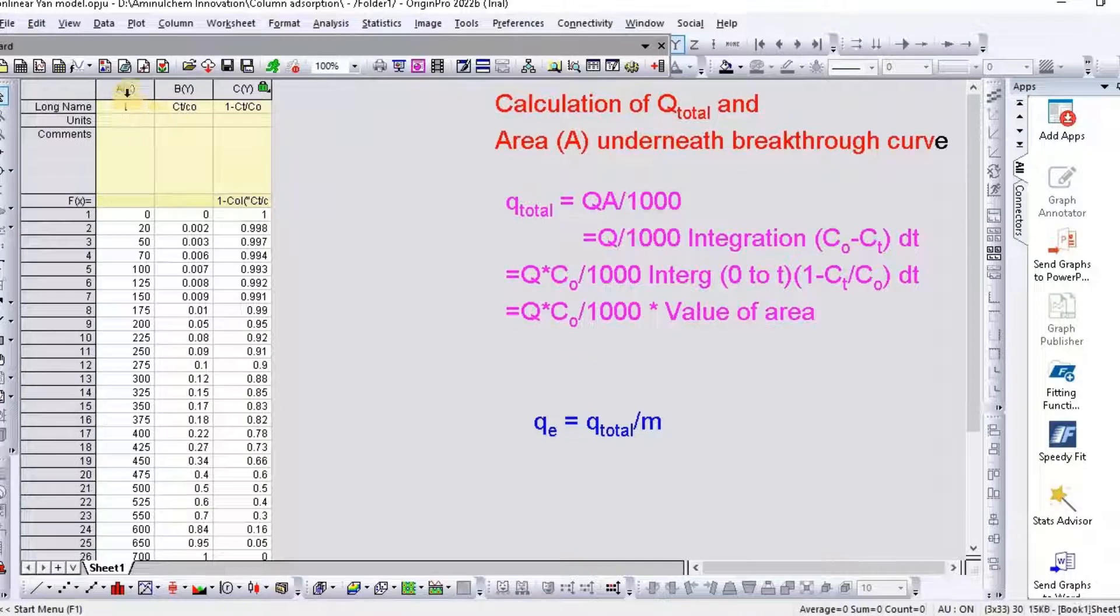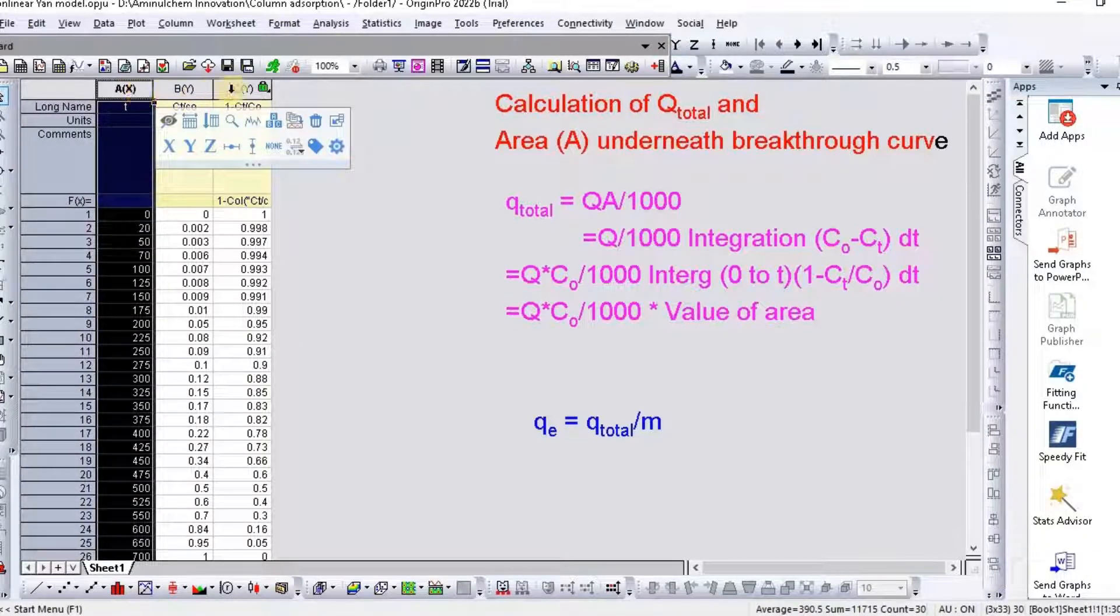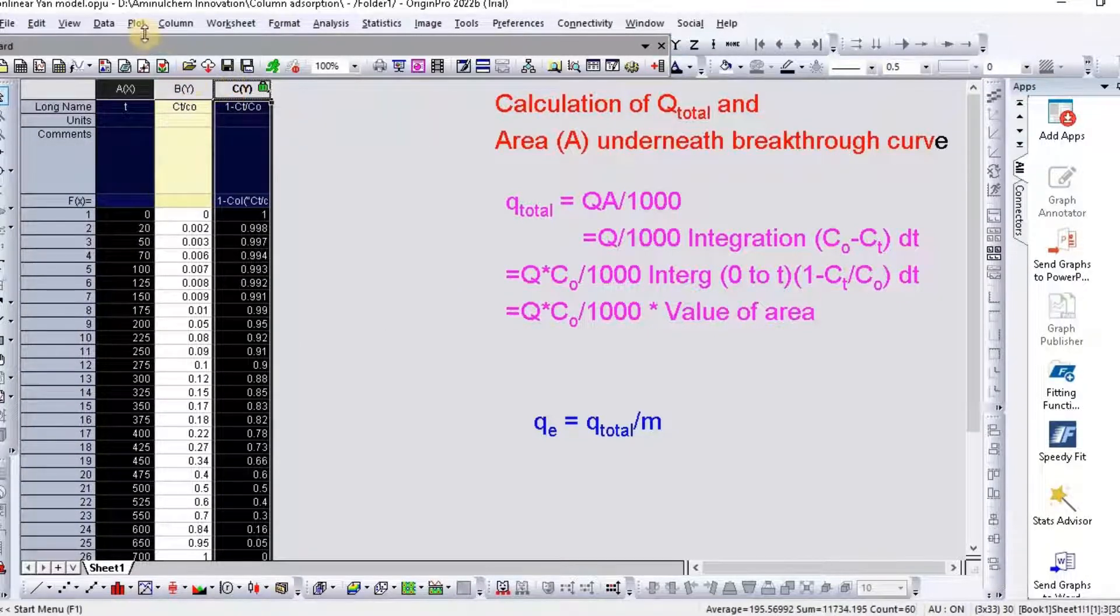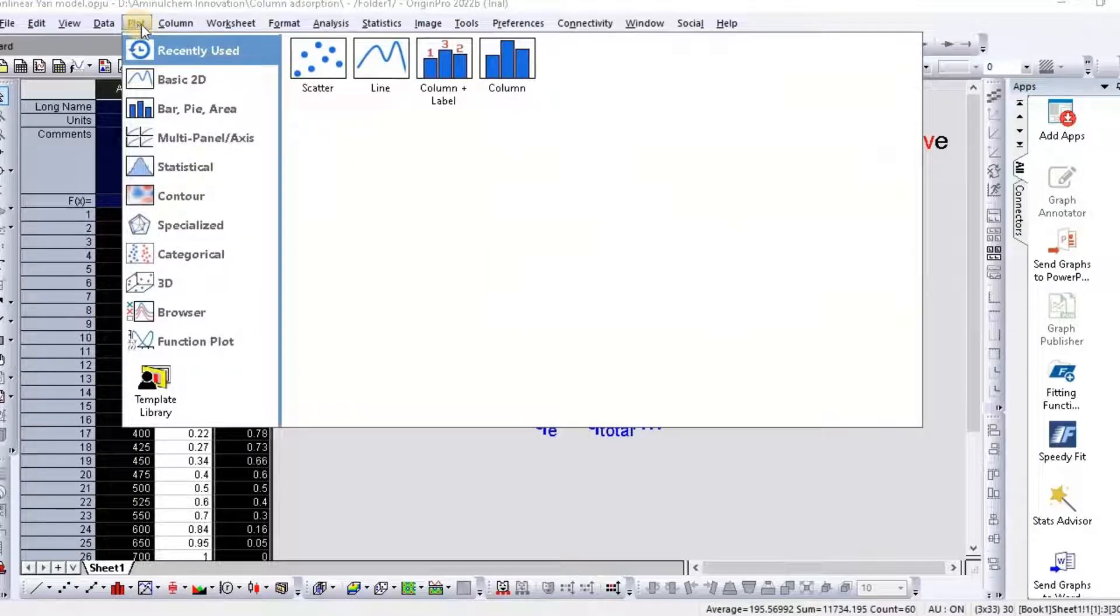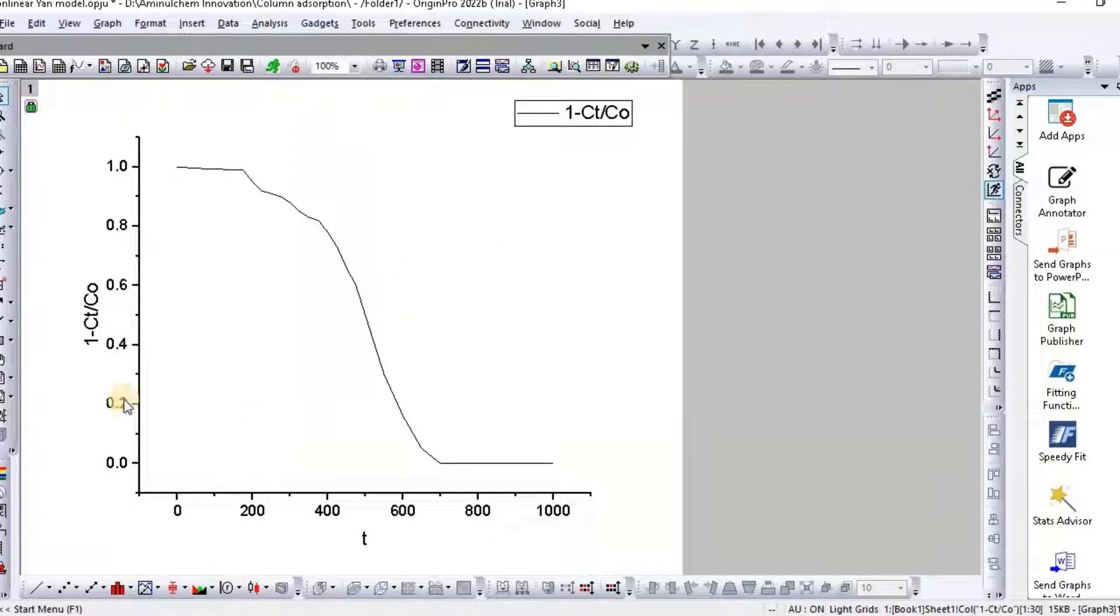Then select this and this, then plot, then you can make it, for example, line. So here is your curve.